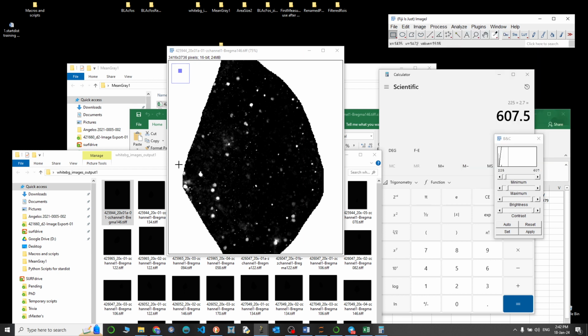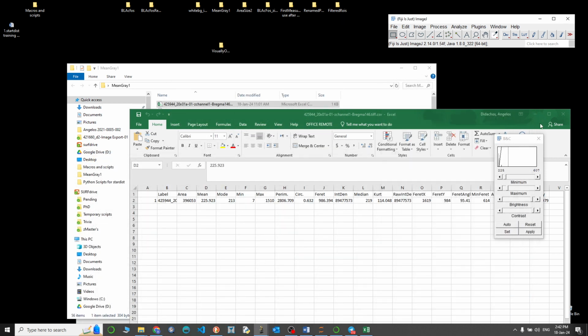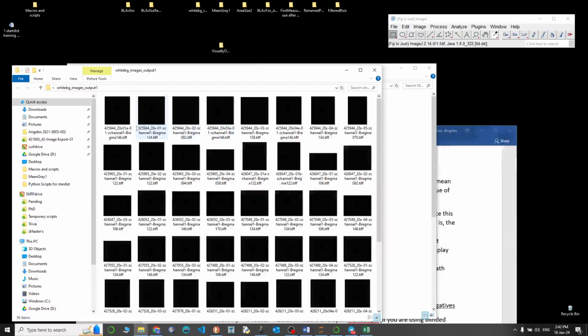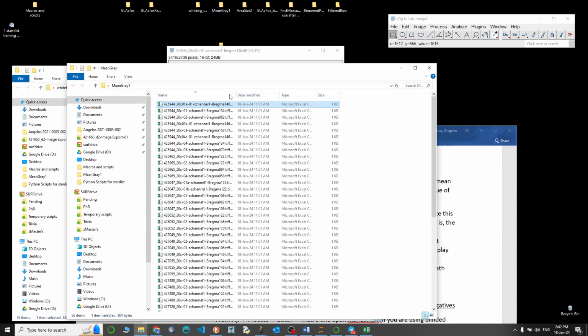So we're producing images like this, and we're going to do it for all of our images, not manually, of course, but by using our script. That's the idea behind it. We want to have a visually optimal, in a sense, image. You can discover what your value is quite easily if you know the measurements from here.